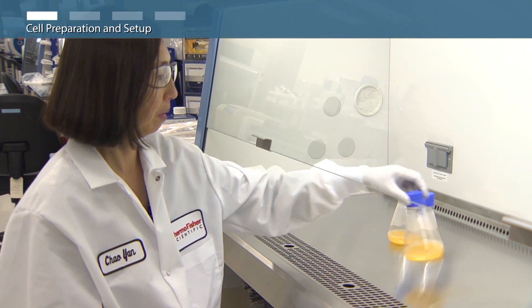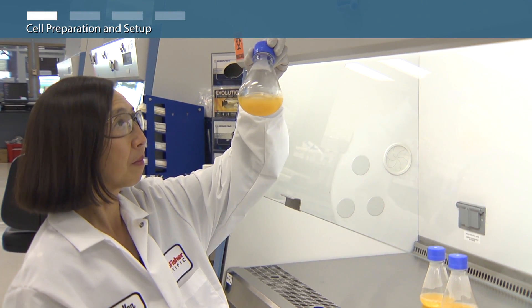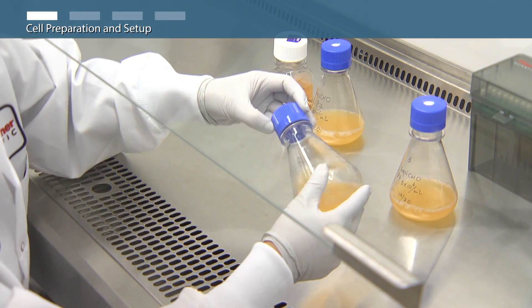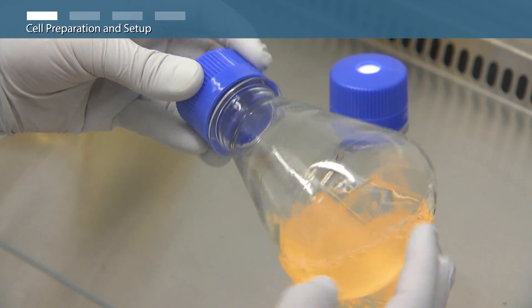In order to maximize expression of XBCHO cells, it's important to maintain high cell viability and a robust cell culture. During all cell manipulations, mix the cells by gentle swirling. Avoid vigorous mixing or pipetting, which can reduce protein expression performance.